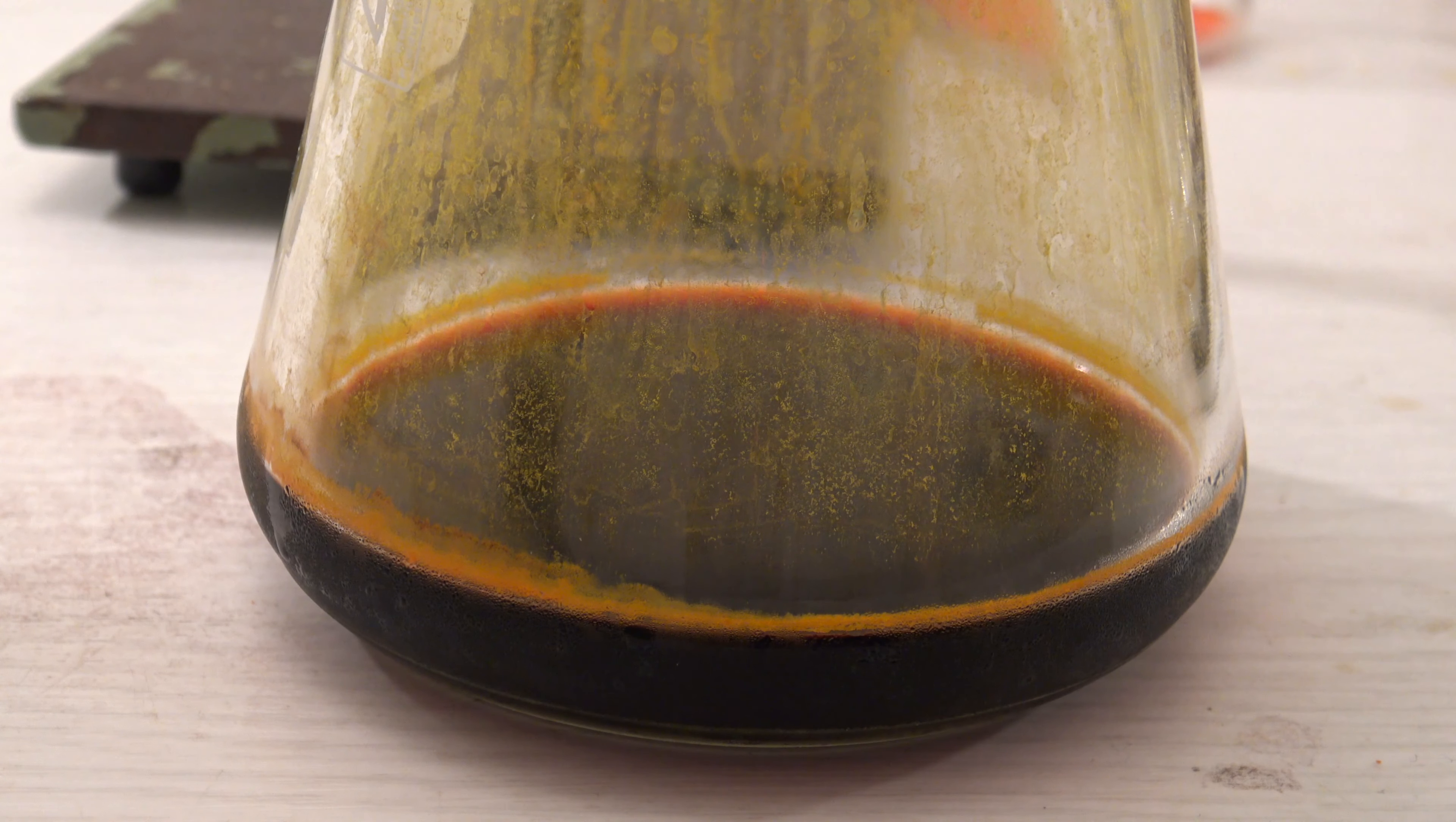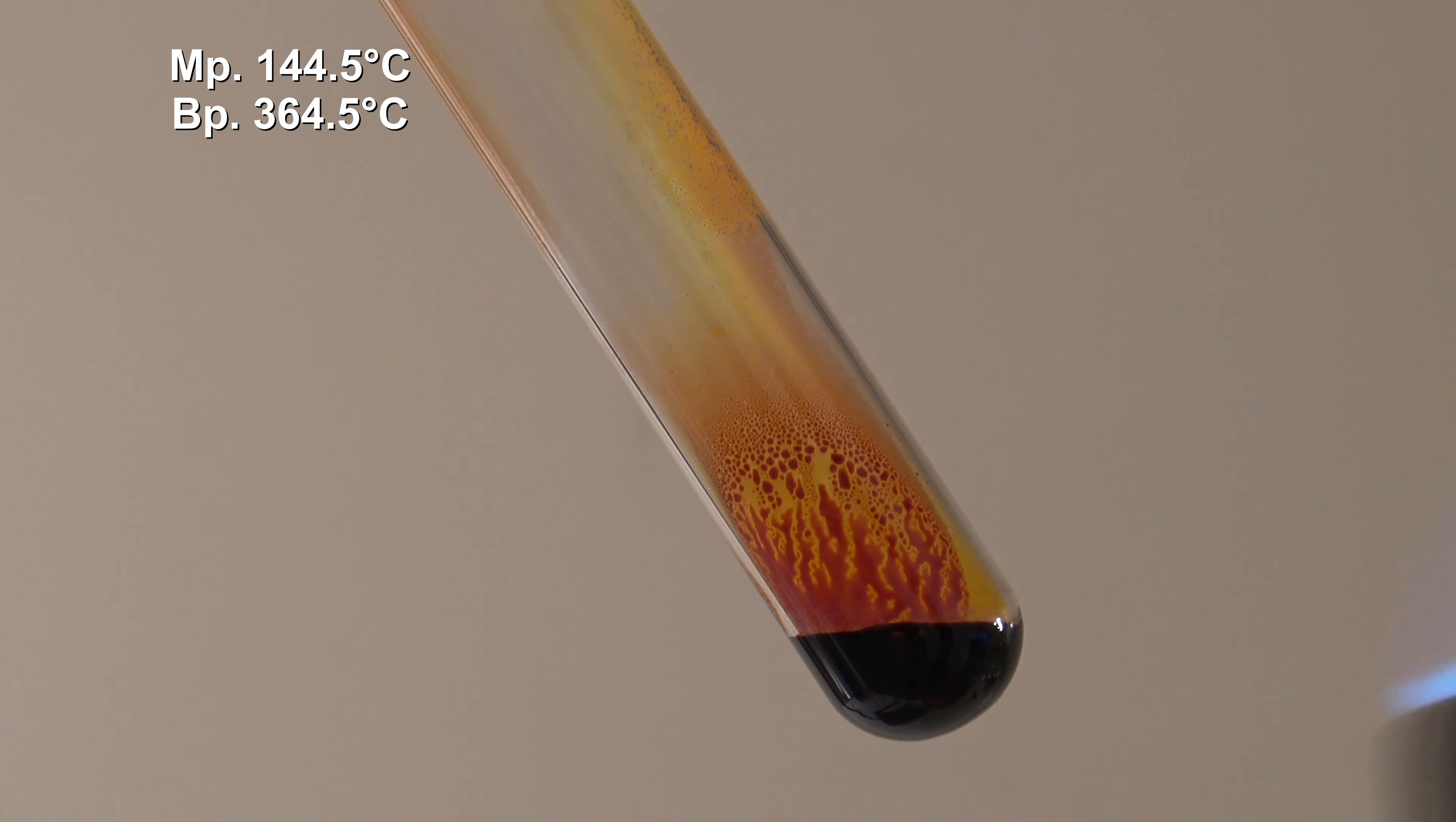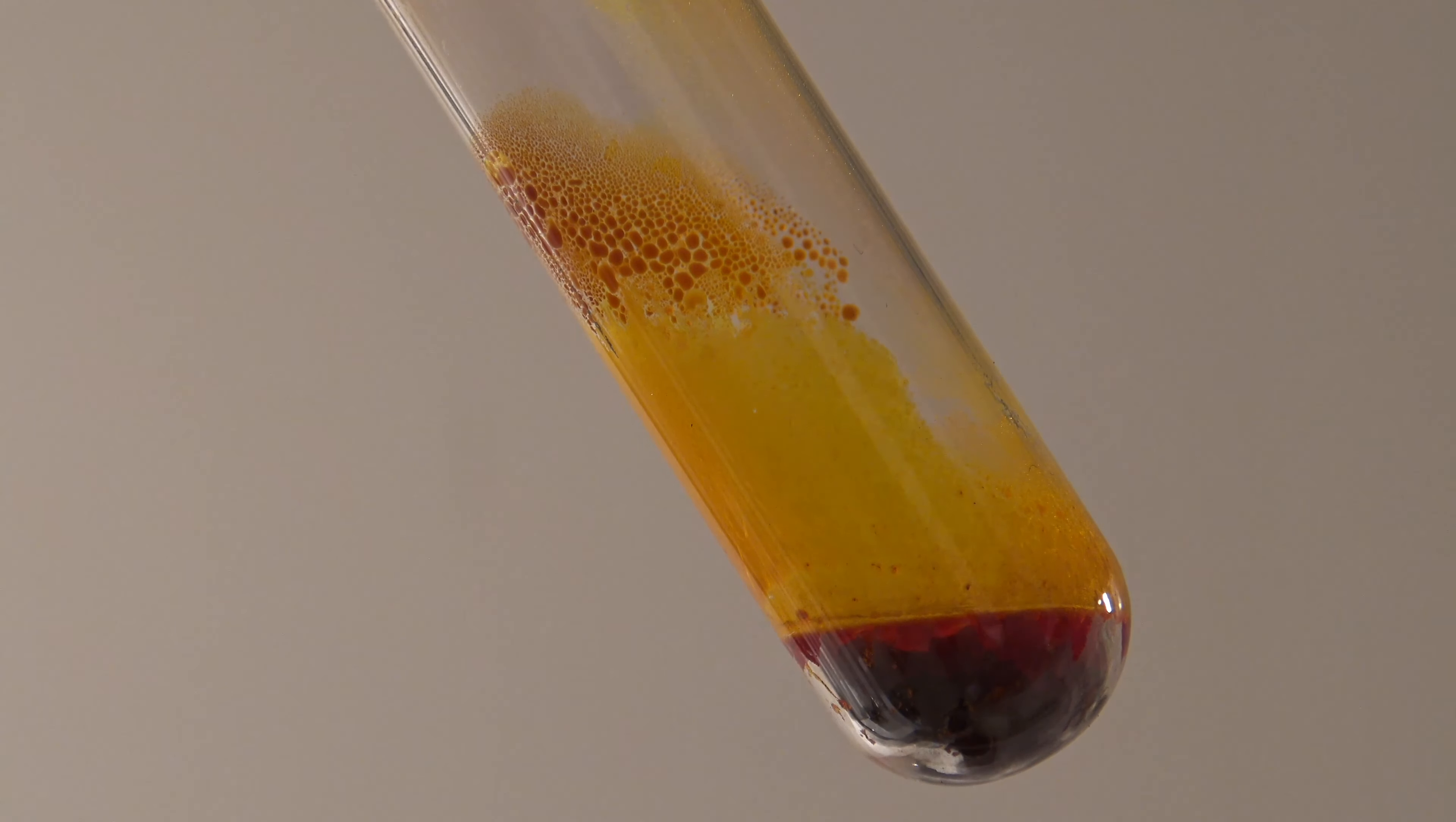To increase the yield, the filtrate could be boiled down even more. Tin(IV) iodide has its melting point at 144.5°C and boils at 364.5°C. Interestingly, it looks similar to bromine in its liquid state until it cools down and crystallizes again.